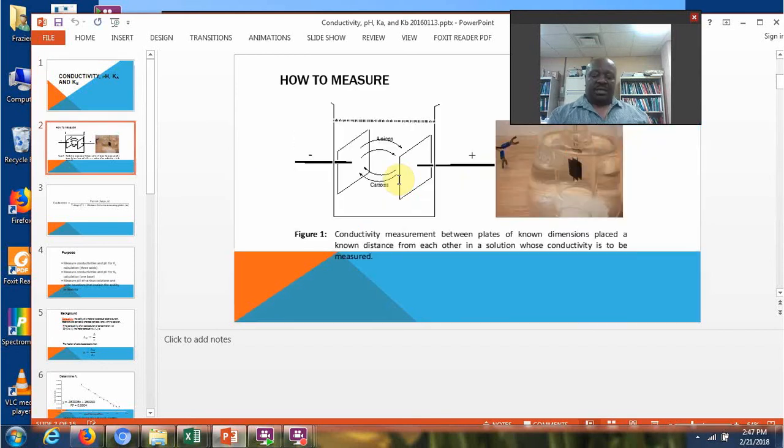Let's talk a little about measuring conductivity. You've seen this figure from the 1510 lab manual. You have an aqueous solution. There are some electrodes here, metal plates, and a solution in here. You pass, in this case, DC, at least for the sake of argument, and ions flow one way or the other. That constitutes a current, and that's how you measure conductivity. You're applying a certain voltage, you're measuring a certain current, and these plates are a certain area.